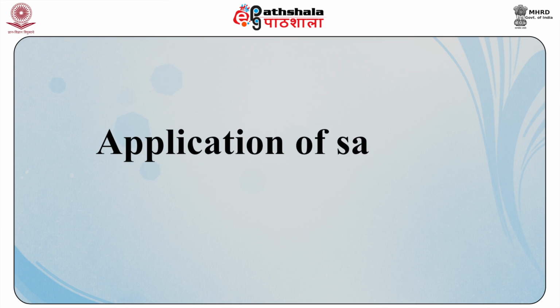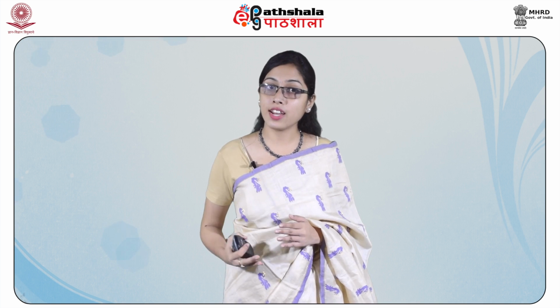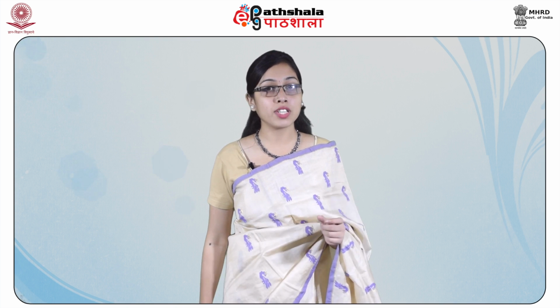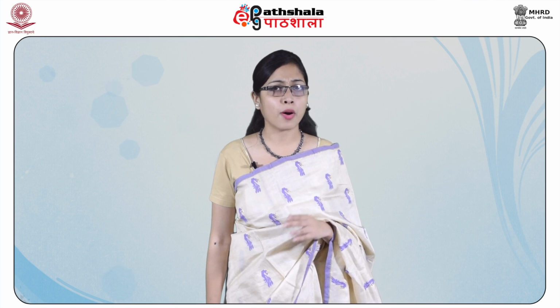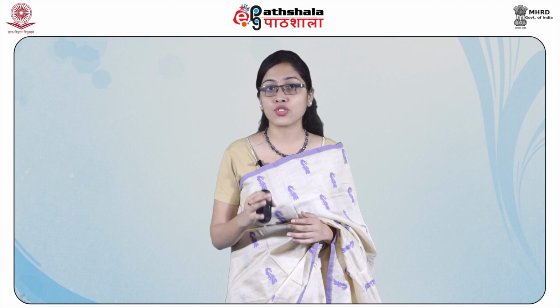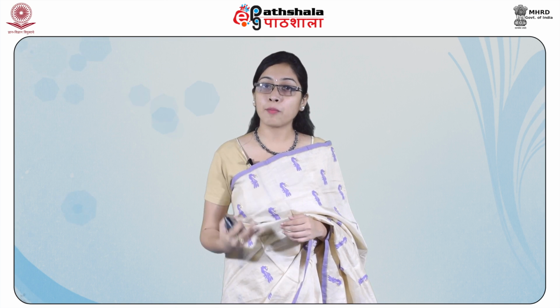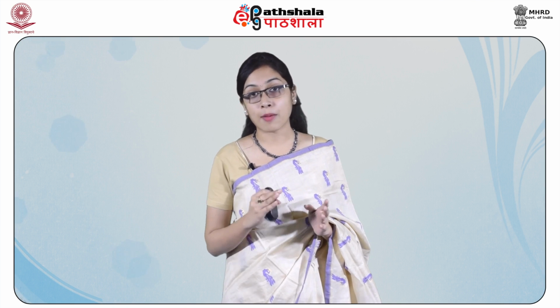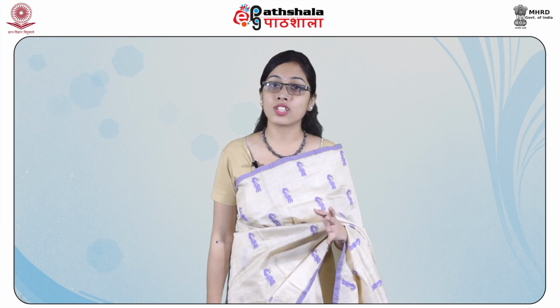The third step is application of samples. The mixture to be analyzed is dissolved in a suitable solvent. A fine line is drawn on the filter paper a few centimeters away from the level of developing solvent. The dissolved samples are applied on spots of diameter about 6 to 10 millimeters that lie at least 3 centimeters apart on the line drawn on the chromatographic paper. The sample application is usually performed using micropipettes. The sample application may be repeated after solvent evaporates from the previous spots to concentrate the sample.